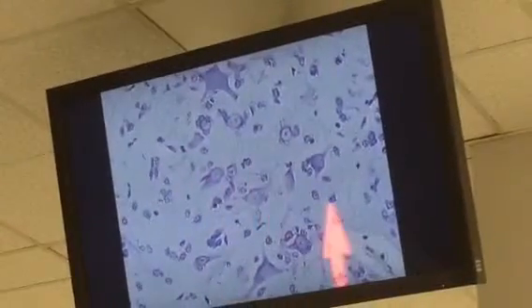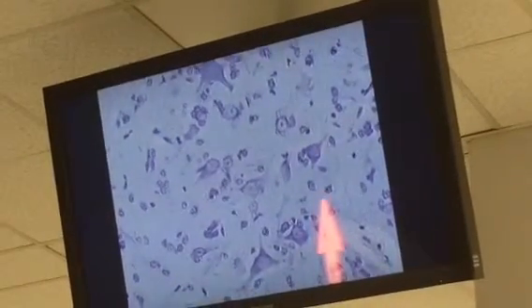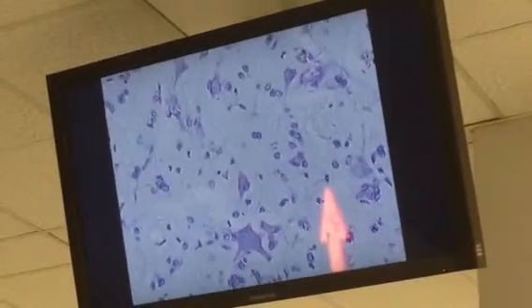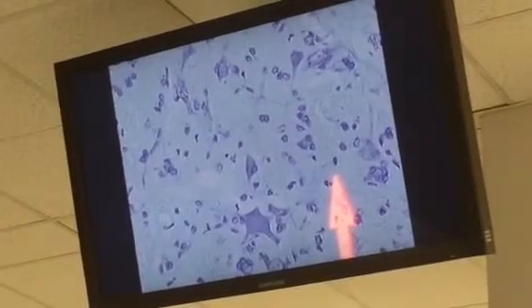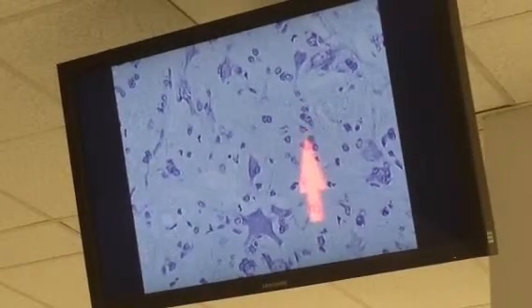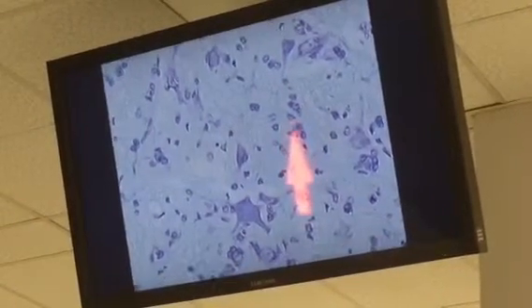So the reason we start in the ventral horn is because it has the largest neuron. Now, you're going to get to a point where you have really small neurons, and you can't really tell the difference on a Nissl stain between a small neuron and an astroglial cell. So, for example, this right here, because of the shape of it, it looks sort of triangular. It could be a small neuron. So there's ambiguous cases as well.